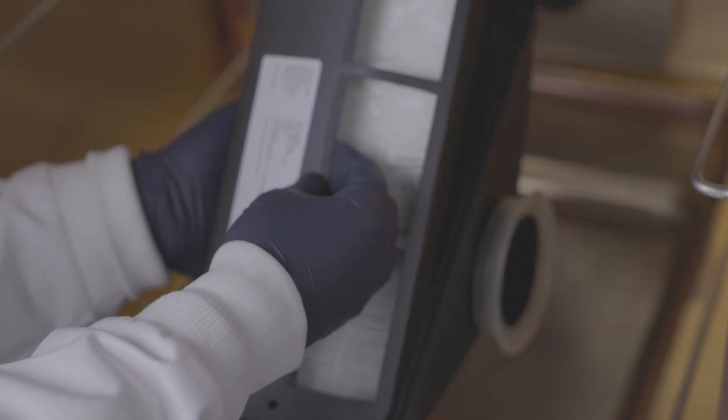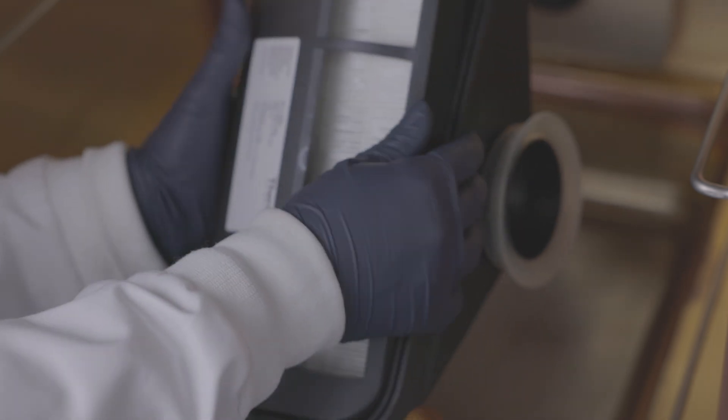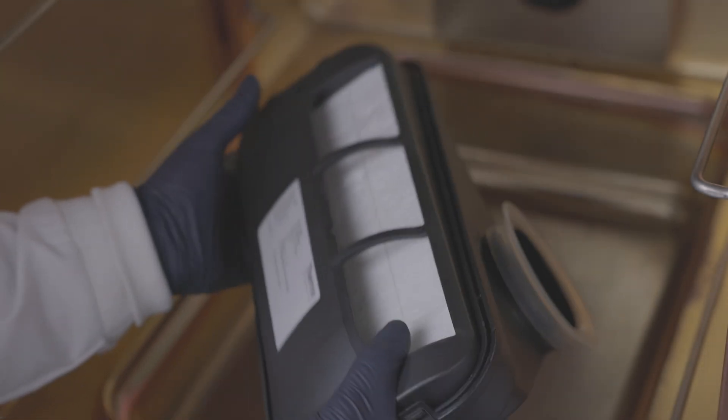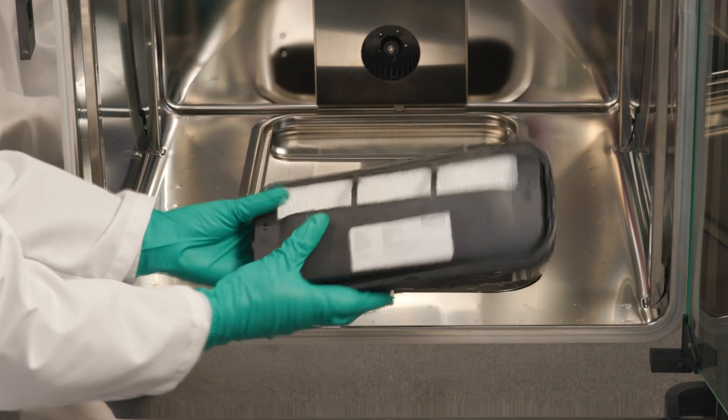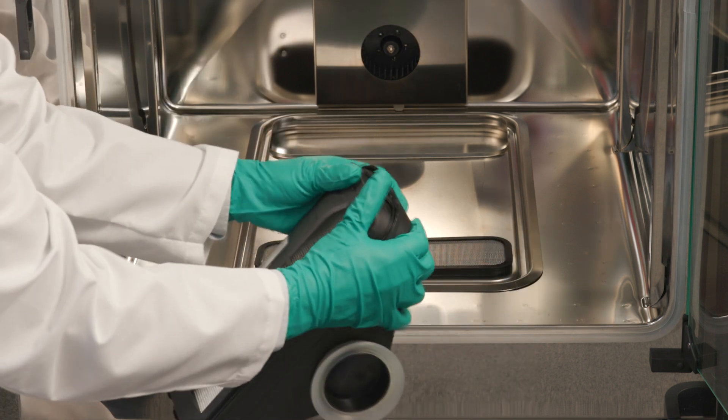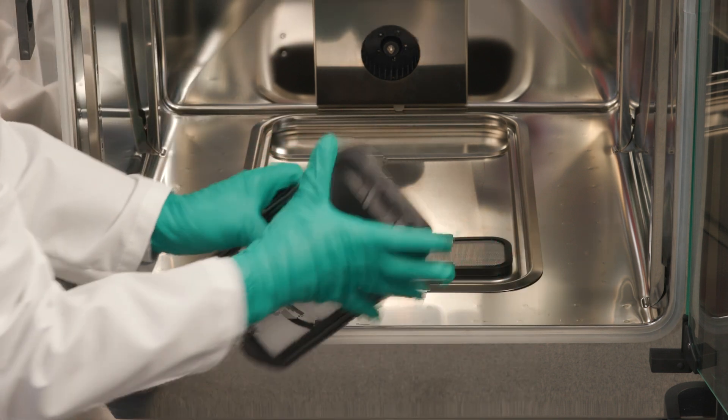Next, tilt the air box to the left and insert the tabs on the left into the corresponding slots provided in the HEPA filter. Then, insert the tabs on the right side of the air box into the HEPA filter catches.